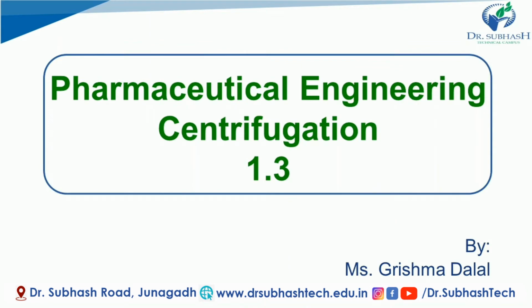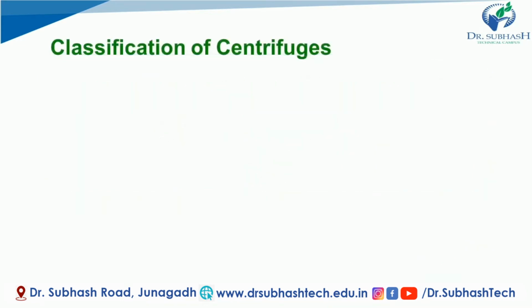Pharmaceutical Engineering, Centrifugation 1.3. In this video, we will see some of the centrifuges, right? If you remember, when I prepared centrifugation 1.1, at that time we studied the definition of what we mean by centrifuge. Centrifuges are the equipment that are used to separate different solutions or different mixtures, you can say. So we are going to see how centrifuges work.